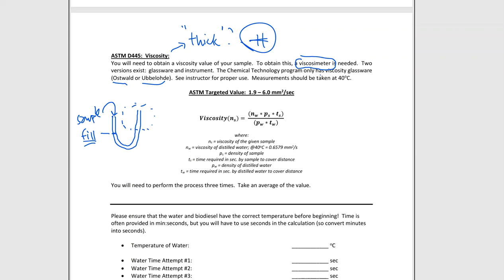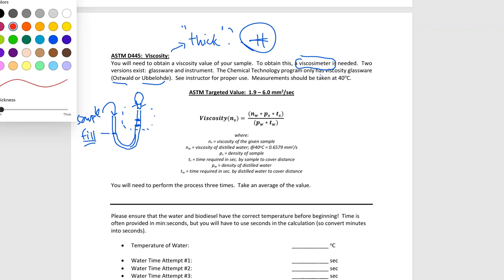On the other side, normally we take something like a pipette bulb, and the pipette bulb will be placed on top of that piece of glassware, and we will use it like we use a pipette bulb when we measure using volumetric pipettes. We let go of the air pocket that we've created, and that will suck sample up into that side of the glassware. So, whoop, up it goes, right? There are often two lines located over here on the right-hand side, and those two lines are going to be pretty important.